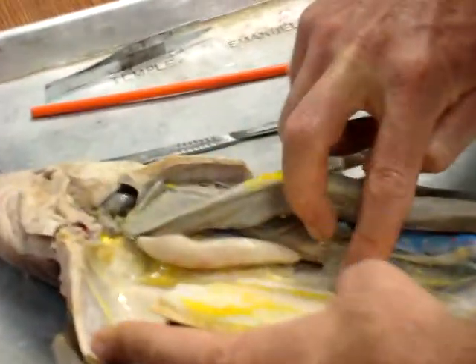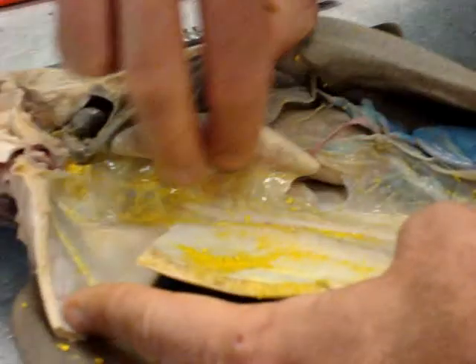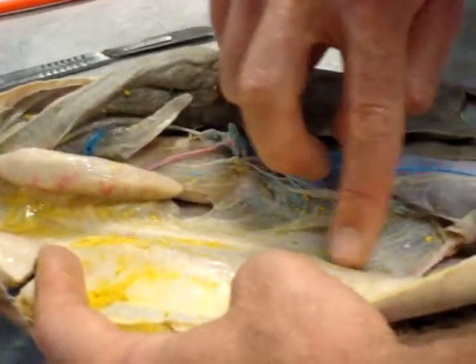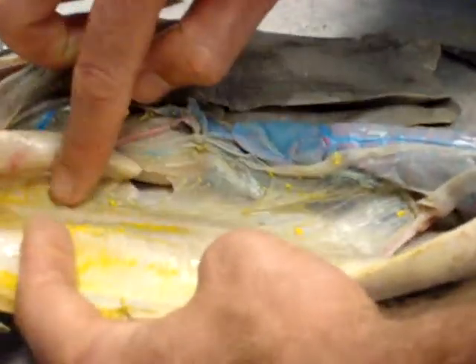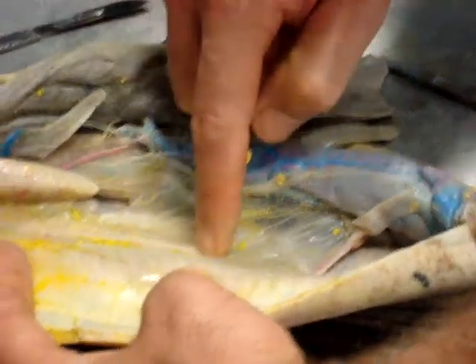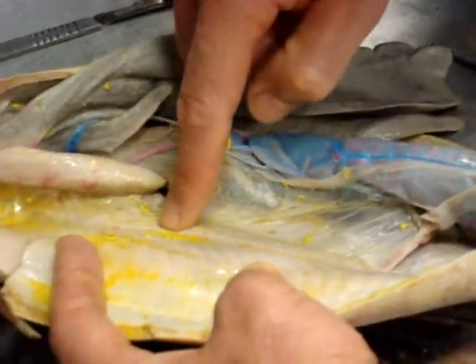Okay. Awesome. If you guys are ready to move on from internal, that'd be great. What do you guys think? Some are not labeled yet. This tissue that runs here. Okay, see this little thing, that's actually the seminal vesicle. The squiggly white line, that's a kidney? This actually takes care of the reproductive end of it. Where this yellow stuff is, see, I'm kind of moving that yellow stuff around. Okay, that's going to be the kidney.